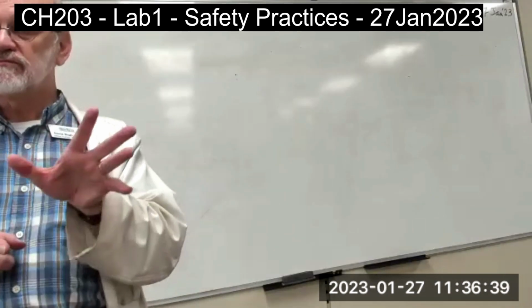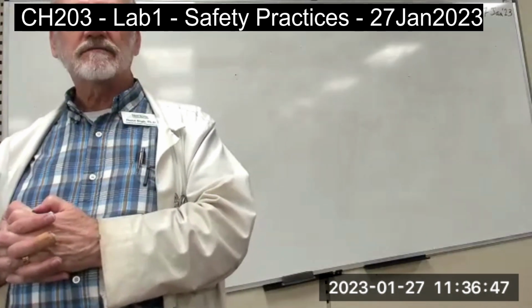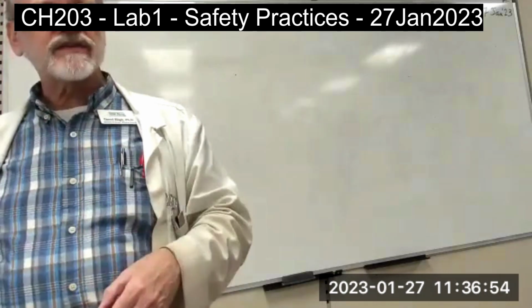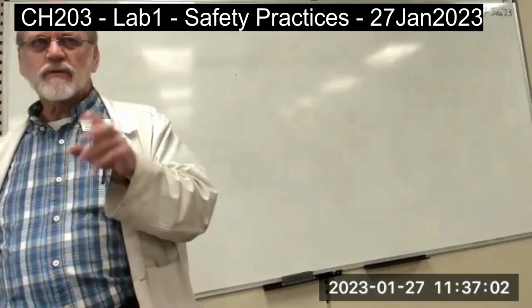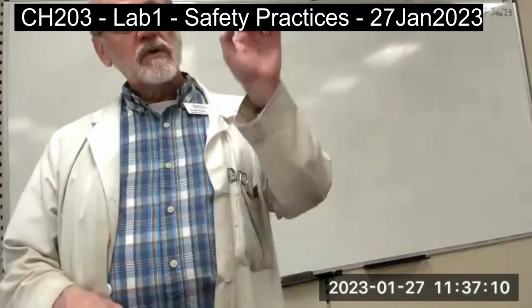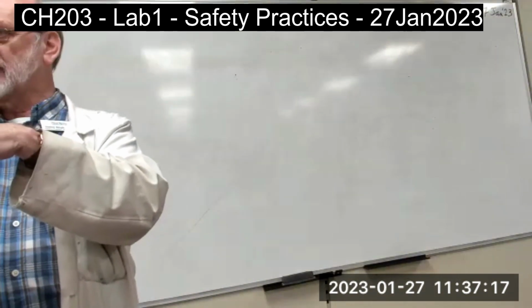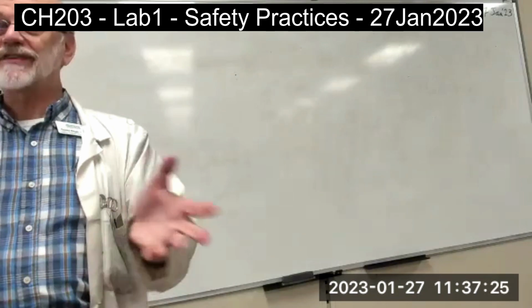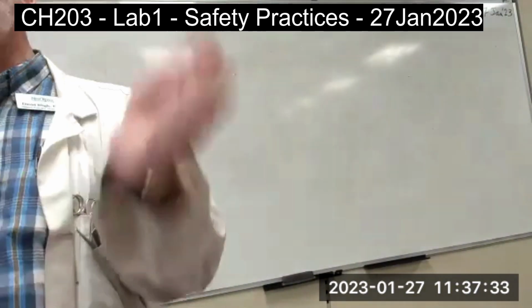Some fire extinguishers do 2 or 3 of those. A carbon dioxide extinguisher does 2 things. Carbon dioxide is cold. It will cool it down and smother it. We have ABCs over here. They work on almost everything. They're primarily made of powdered phosphate chemicals, ammonium phosphate, I think, mostly. When you use one of these fire extinguishers, if it's been sitting on the wall for a while, that stuff is going to be settled in the bottom. So before you pull the pin and pull the trigger, turn it upside down a couple of times, if you've got the time. In fact, that's what we should be doing every week or 2. We ought to take those fire extinguishers and just mix them up again, so they'll be ready.